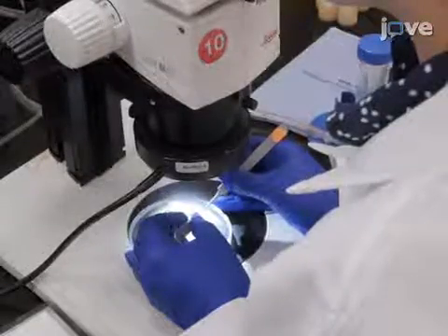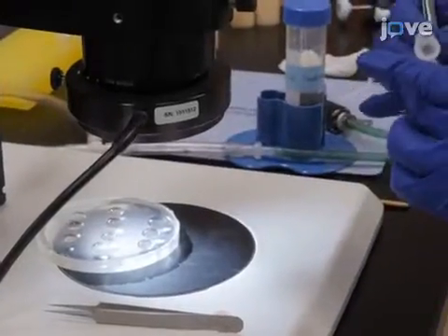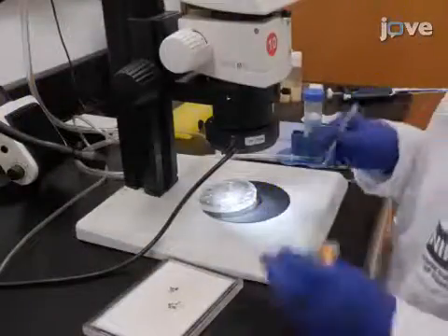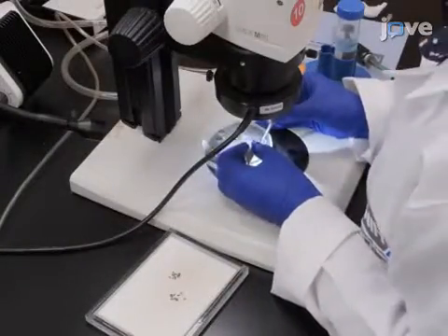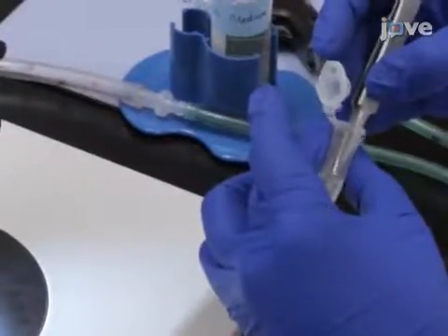Finally, transfer the ovaries to a 1.5 milliliter microcentrifuge tube containing 500 microliters of clean Drosophila medium with 10% FBS. Repeat the dissection to collect as many ovaries as desired, placing 10 to 15 in each microcentrifuge tube.